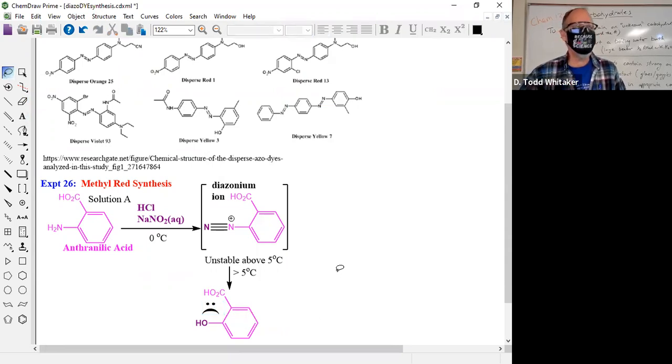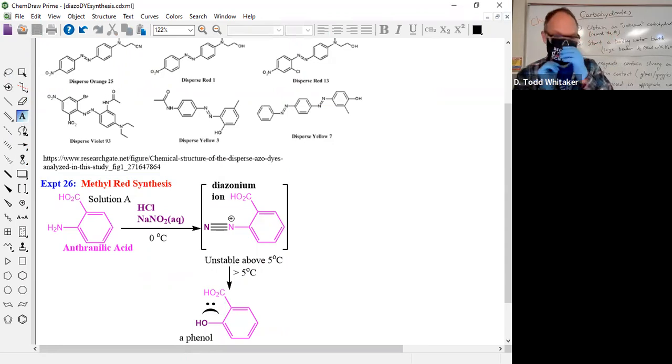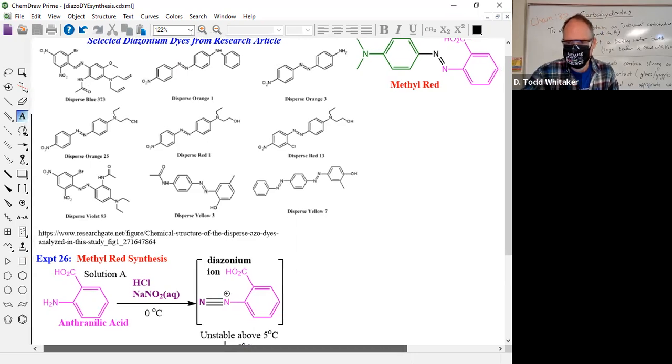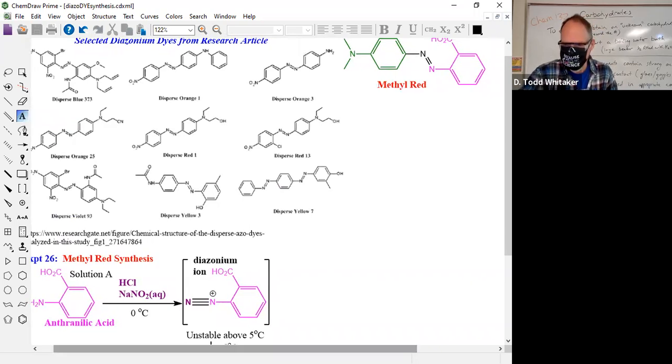There you go. I don't want that. That's a phenol. A phenol. What's that mean? Phenyl group attached to what? OH. So no phenols today, please. What's happening? You're doing this right now, and then you're going to be adding a new chemical pretty soon. What chemical is that? What organic chemicals coming up on your list? Sodium acetate, I'll give you that.